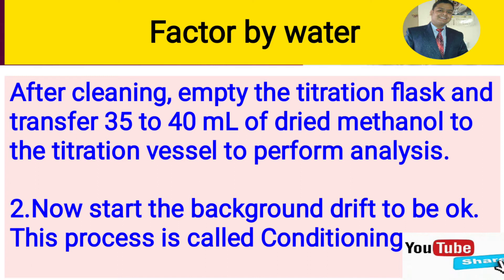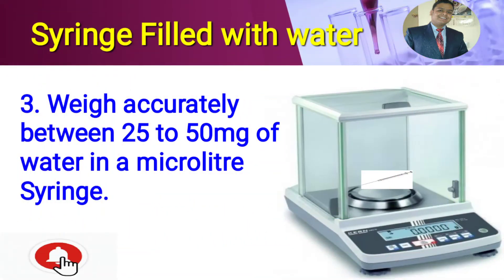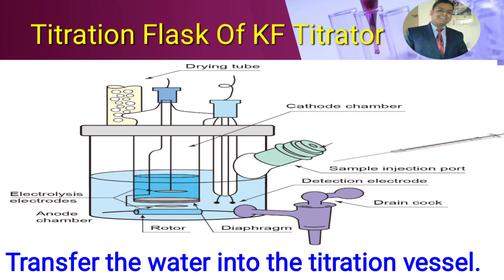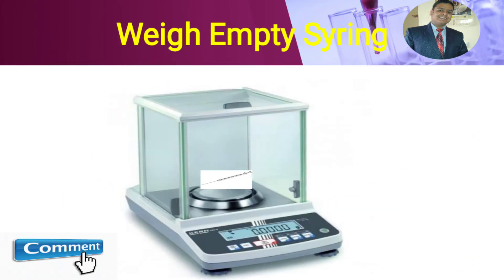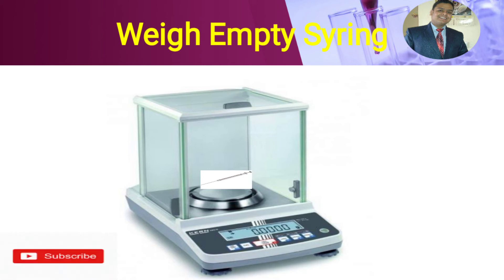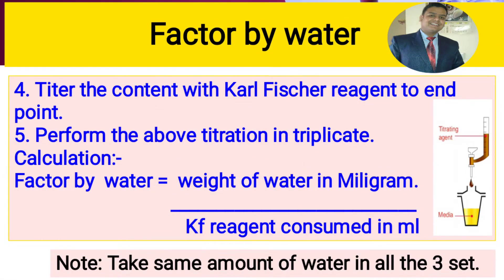Now take 25 to 50 mg of water in a microliter syringe and after taking it, weigh the syringe on the analytical balance. Then introduce the sample inside the titration flask. After that, take the weight of the empty syringe, and by subtracting the weight of the empty syringe from the filled syringe, we will get how much amount of water was introduced inside the titration flask. Start the titration and wait for the result. The same analysis should be done in triplicate.